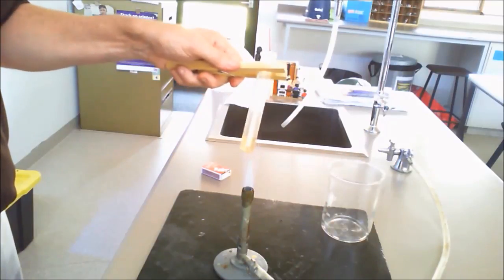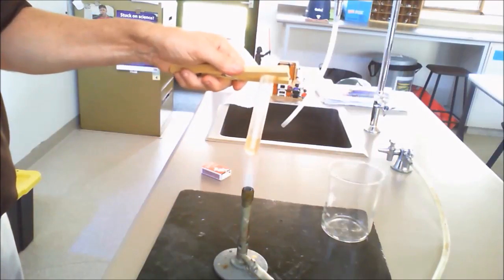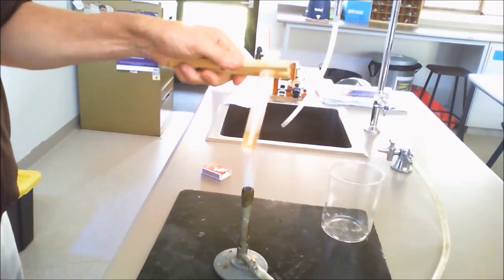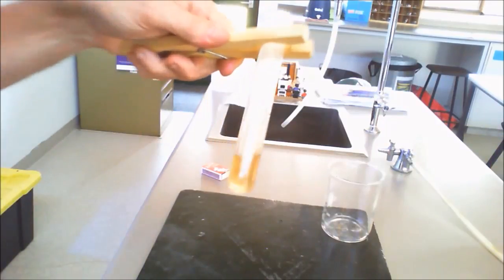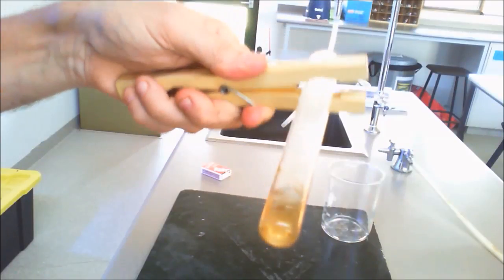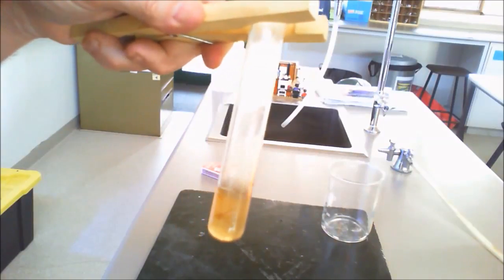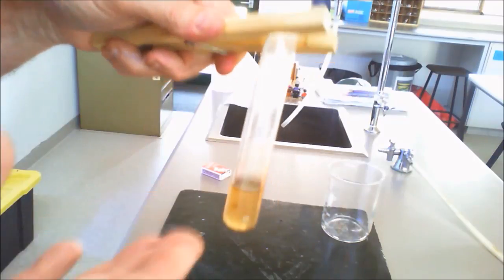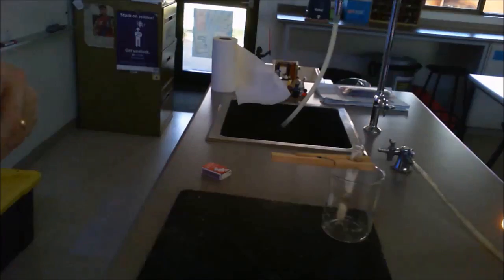Now, obviously there, just moving it through, you can see that just a slight flame, a slight amount of smoke, is being given off, and right there we've changed it to a liquid. We'll move that over to there. So there's our liquid that has been changed. So again, you can see there that you can pour it down the test tube. So that's the liquid. So what I need you to do now, please, is to fill in the worksheet based upon the characteristics that you see of the liquid.